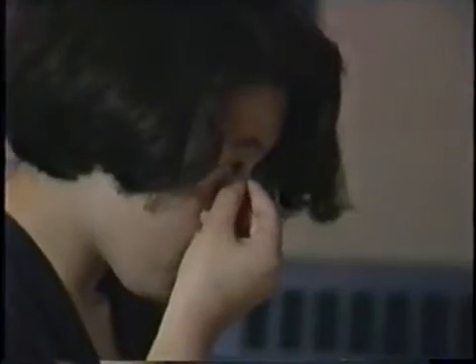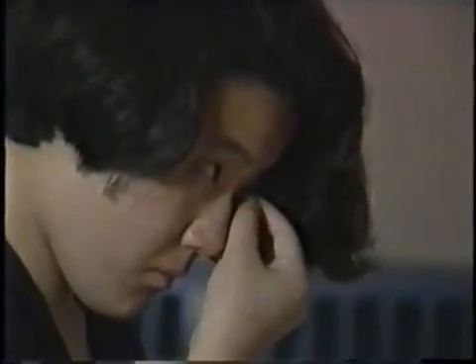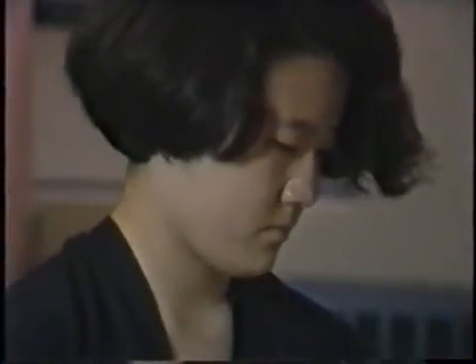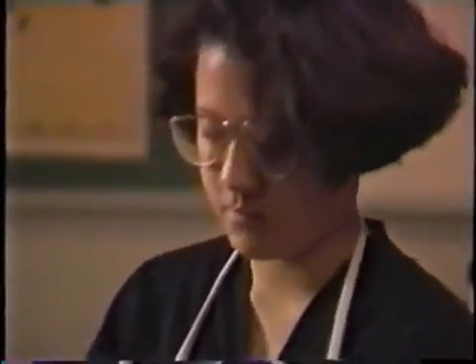Don't wear contact lenses in the lab — they may trap chemical vapors against your eyes. If that happens, your eyelids may go into spasms that make it impossible to remove the lenses and wash out the chemical. Always wear goggles with side shields to completely protect your eyes, even if you're already wearing glasses.